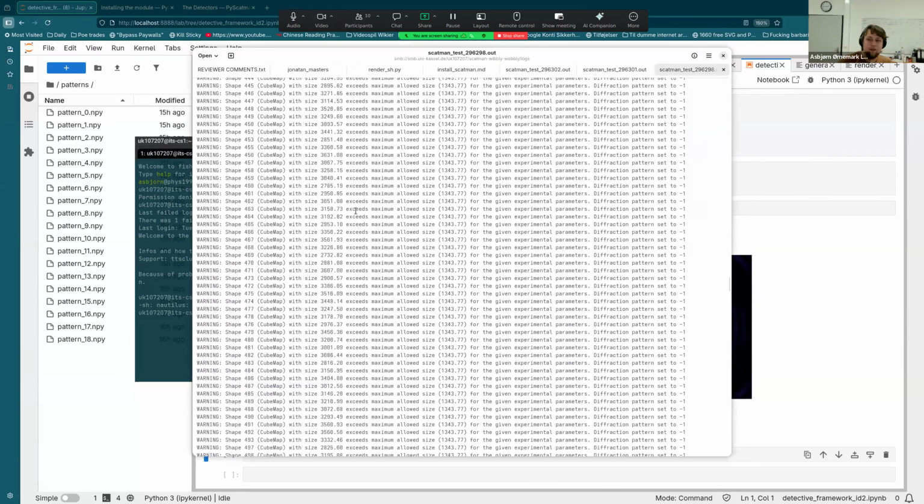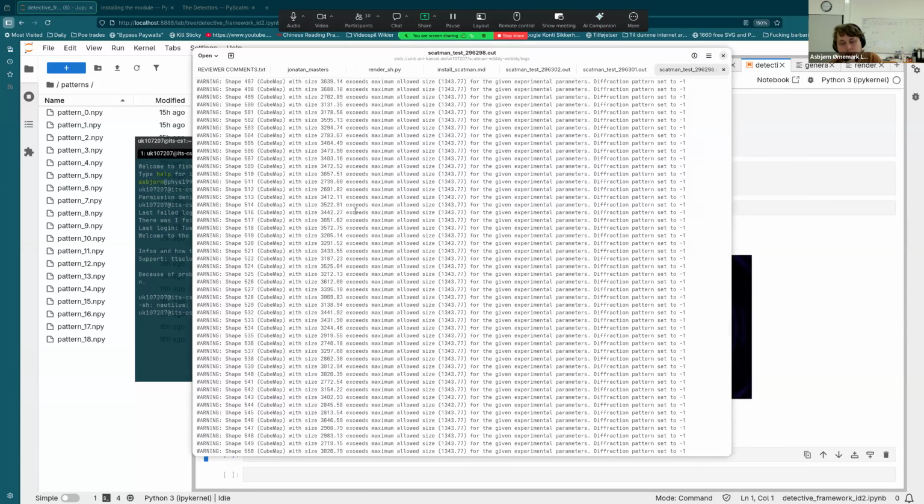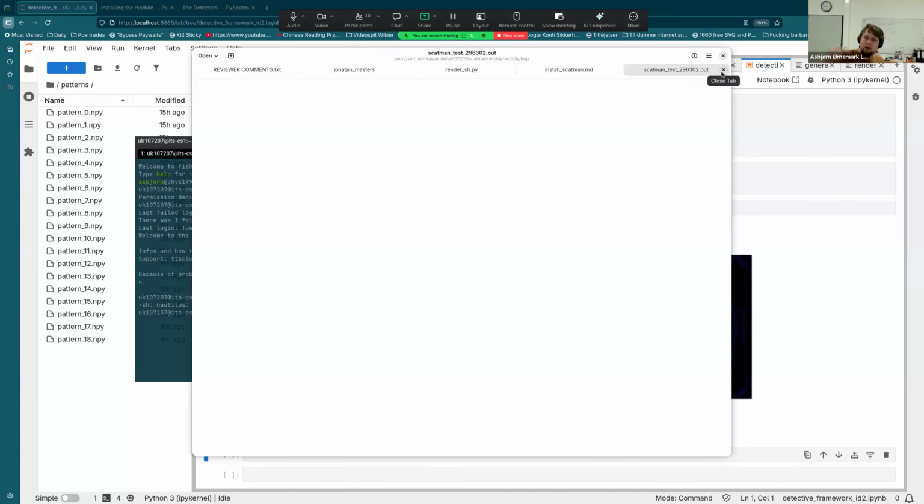The thing I can tell you is it took like 12 hours to run through 1,000 iterations of the fitting algorithm or something. This is partially my own fault because I was trying to do a 6 times 6 times 6 matrix, and then you have 216 dimensions that you need to fit, and you really cannot fit with just gradient descent because these images change in weird ways when you change them.